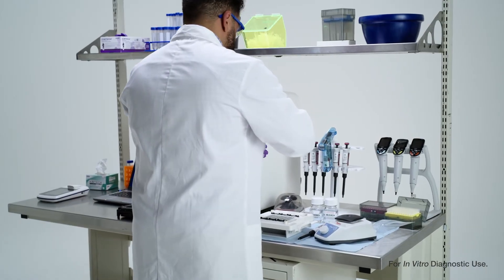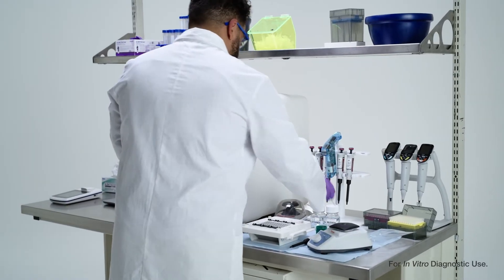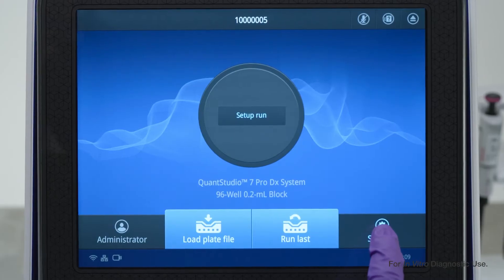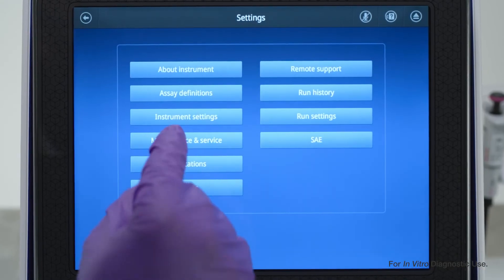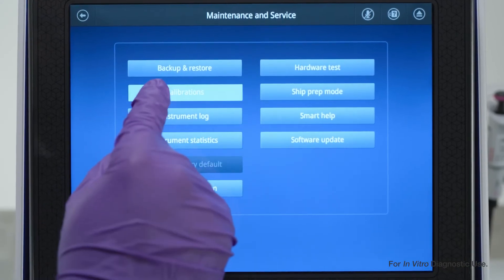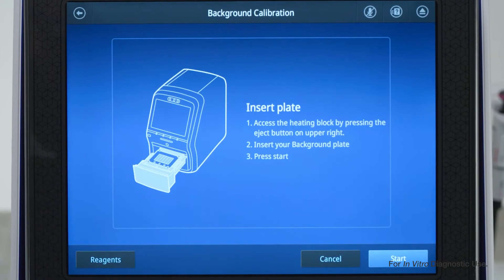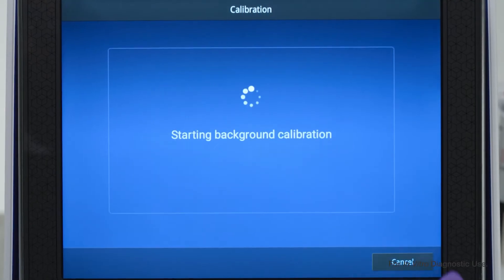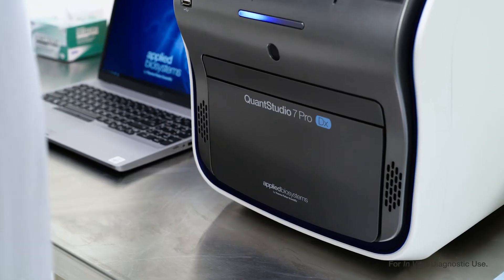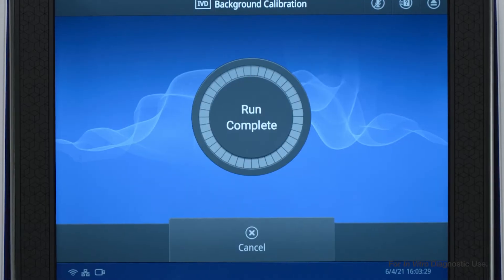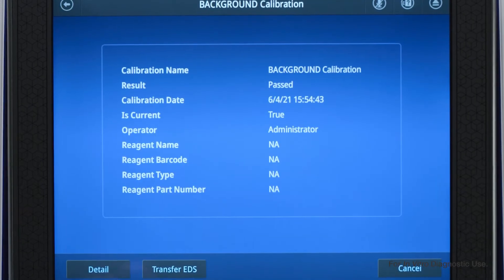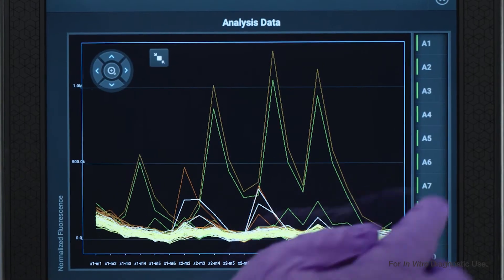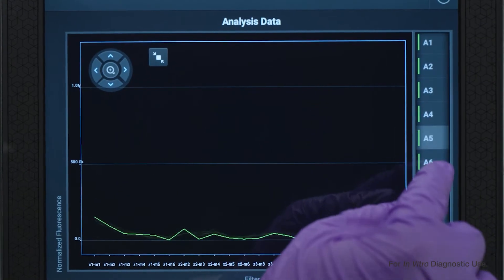A background calibration check is the simplest way to reveal contamination. To perform a background check, select Settings from the home screen and choose Maintenance and Service. Select Background, then insert your background plate and start the calibration run. The run will take roughly four and a half minutes. Then review your analysis data to find wells with consistently and abnormally high signals. These are most likely contaminated.